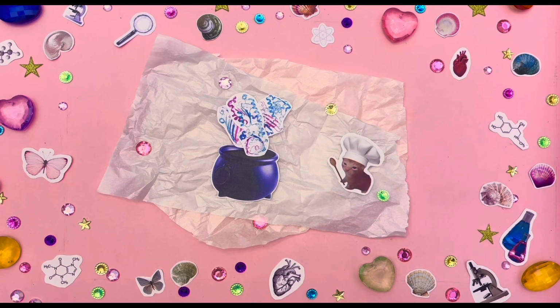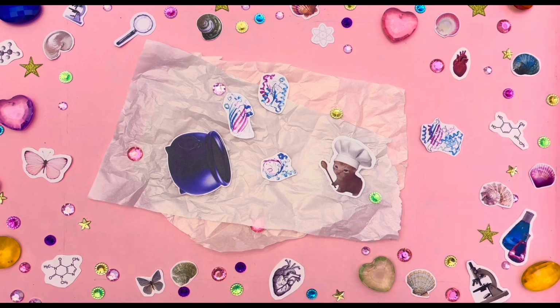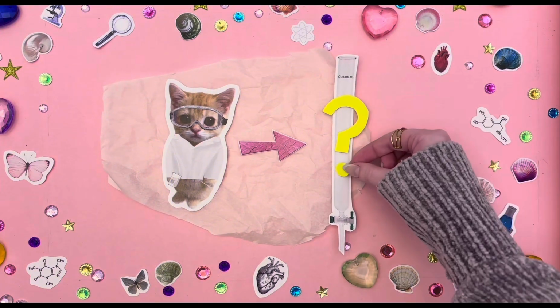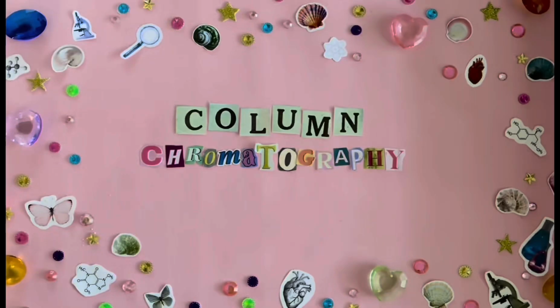I knew how proteins worked. I could identify their structures from primary to quaternary, but I did not understand how one could ever attempt to isolate them. My curiosity led me to one specific technique, one so powerful that it has been referenced in over 736,000 studies since 1941, and has given rise to many of the life-saving modern pharmaceuticals we have access to today. In this video, I'm going to be talking about column chromatography.